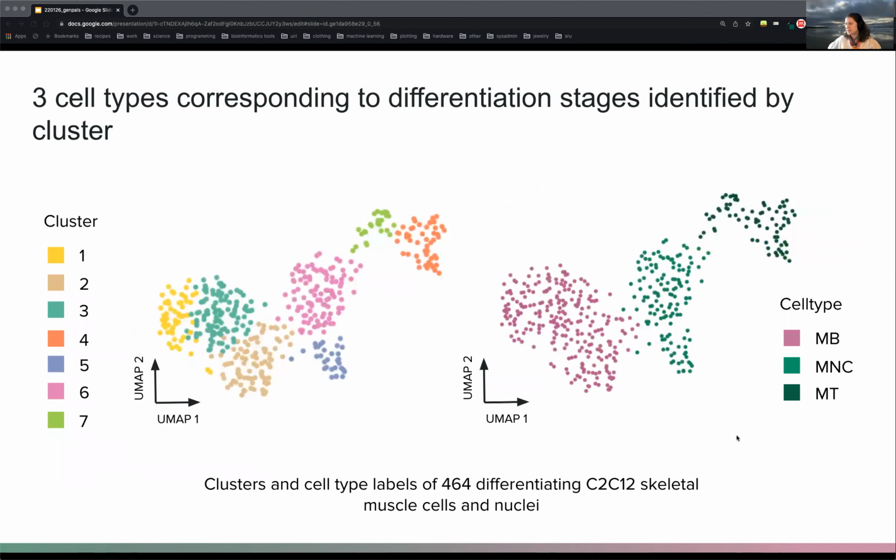So we plot these just briefly because it's single cell data, we've got to show UMAP. We essentially found these different clusters on the gene level, and we used these clusters to inform our cell type labeling of those aforementioned cell types that I mentioned on the previous slide that I'll be using to perform the analyses between in the coming slides.